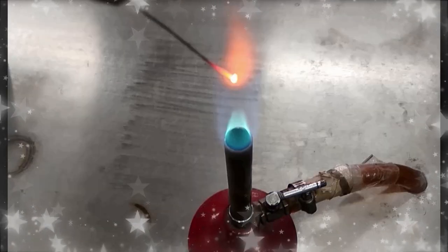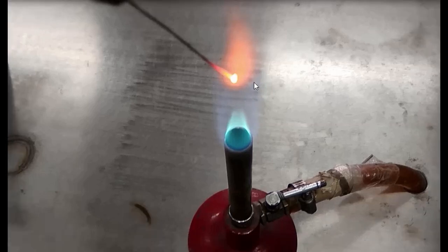An amazing fact about the Bunsen burner is that the hottest part, this one, this one is the hottest part of the Bunsen flame, which is just above the tip of the primary flame, reaches about 1500 degrees Celsius or 2700 degrees Fahrenheit.